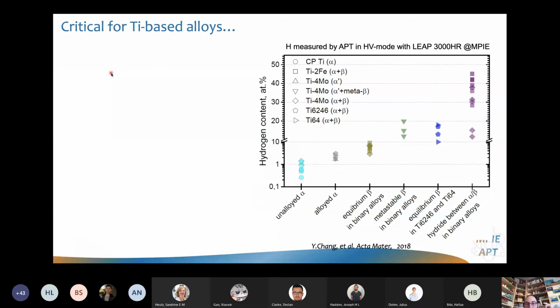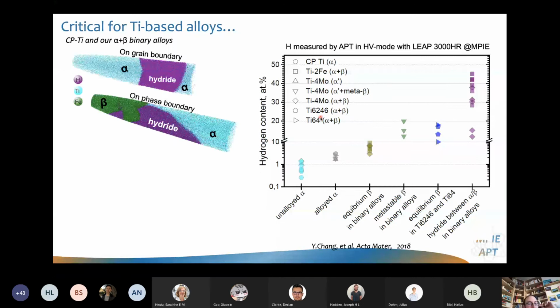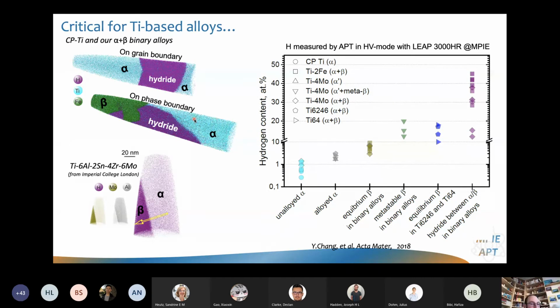So we looked at a range of different alloys and a range of different conditions. Titanium has two different phases, an alpha HCP phase and a beta, which is BCC. We looked at how much hydrogen we would detect after the preparation with the FIB. Often we would find these hydrides at an interface between alpha and beta. And even when we could not find hydrides, in the Ti-6246 that we were looking at with Dave Dye's group, we could see large amounts, maybe 15-20% of hydrogen inserted into the beta phase. So again, if you want to look at hydrogen, it's a bit of a problem when you put so much hydrogen inside the specimen during the prep.